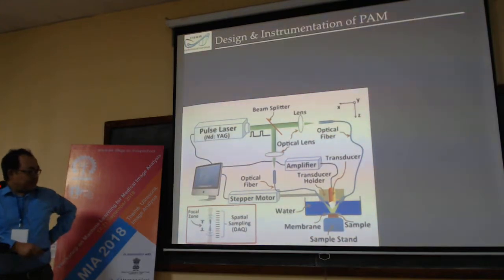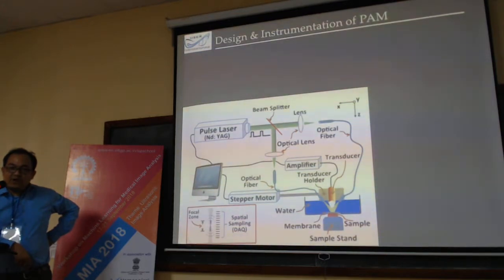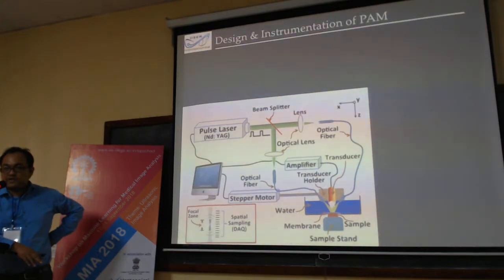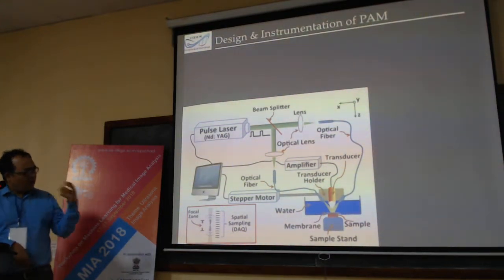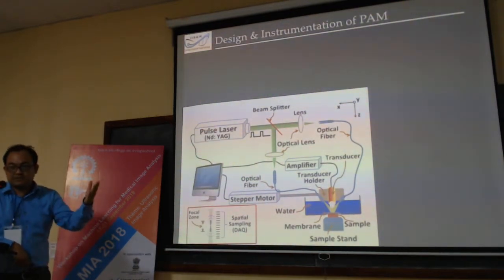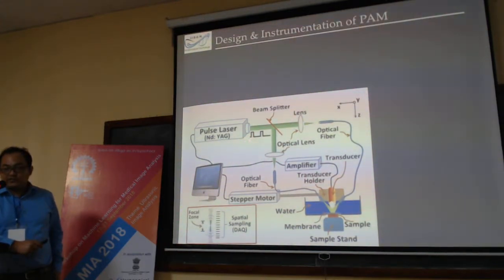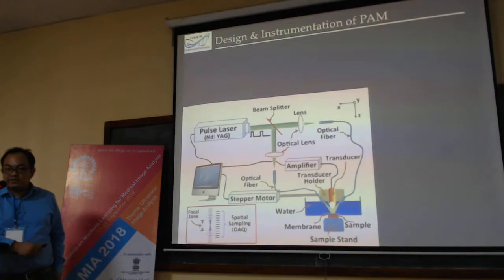However, the excitation and the acquisition have to be synchronized, because the lifetime of the photoacoustic signal is of the order of microseconds, 10 to 15 microseconds. The acquisition has to be done before the excitation of the next pulse. For the laser pulse, people typically use a width of 1 to 10 nanoseconds, and a rate of 10 hertz; we are using around 100 to 200 hertz.